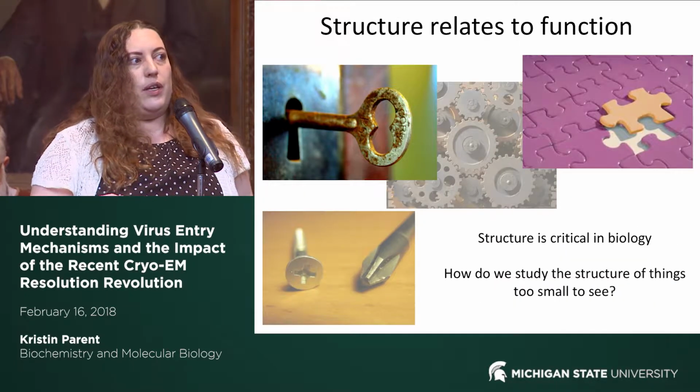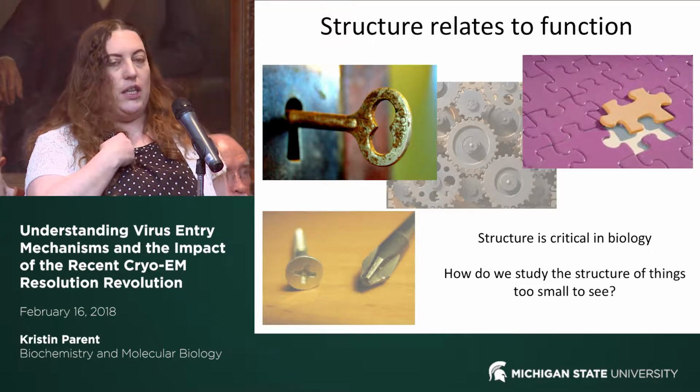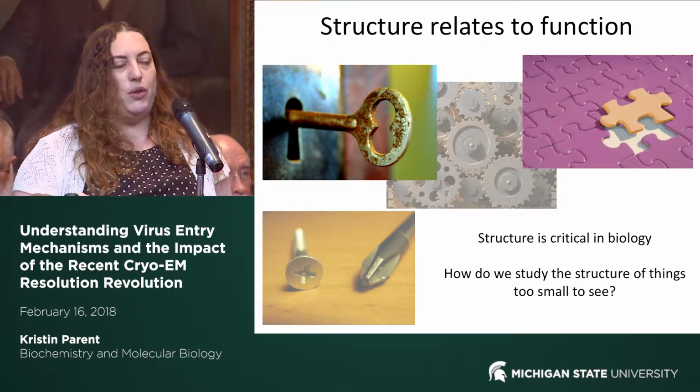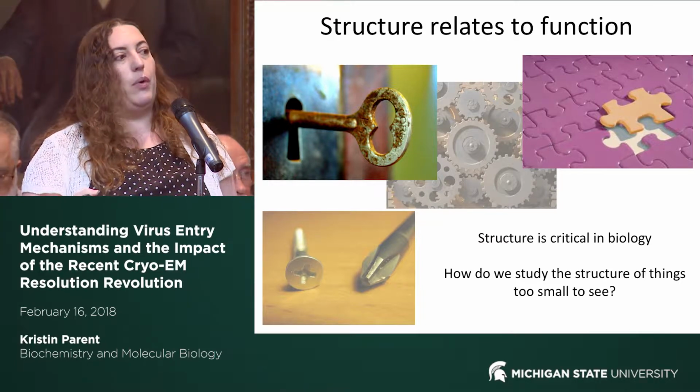And the way that we do this, at least in my lab, is to look at the structure of how these viruses attach to their cells. And this is a key theme in biology, that structure relates to how something works. So from these common household items on the slides, you can see very clearly that the way they're shaped is really important for the way that they work.